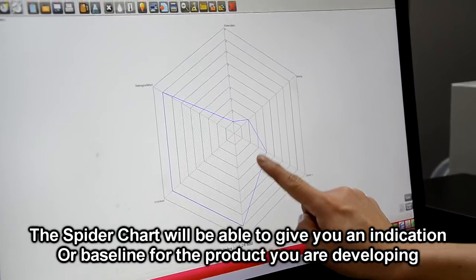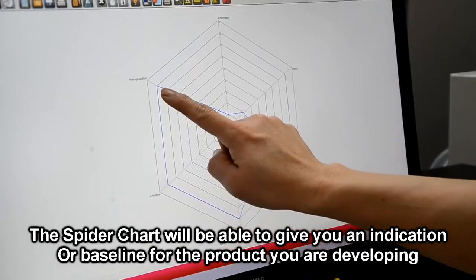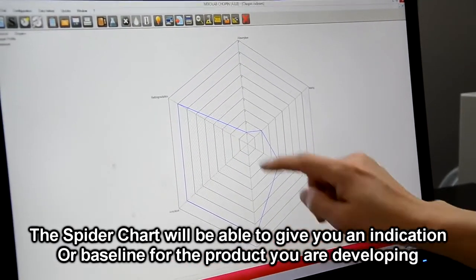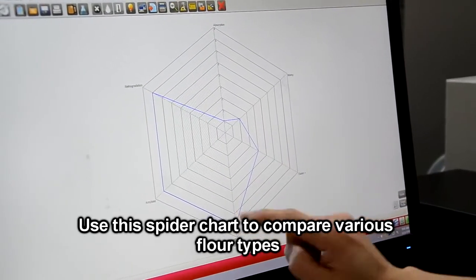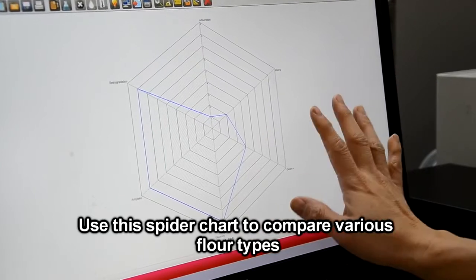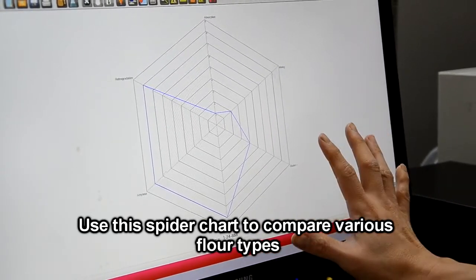The spider chart will be able to give you an indication or baseline for the product that you are developing. And you can compare this particular spider chart with various different flour types and formulations as well.